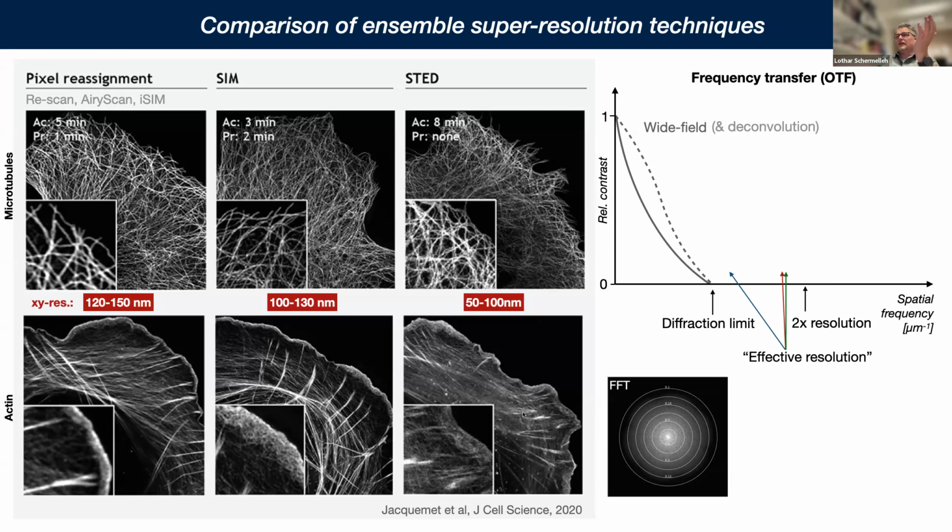Now, why is that the case? We have to not focus on these top resolution numbers, but look at how contrast is actually transferred by the optical system.